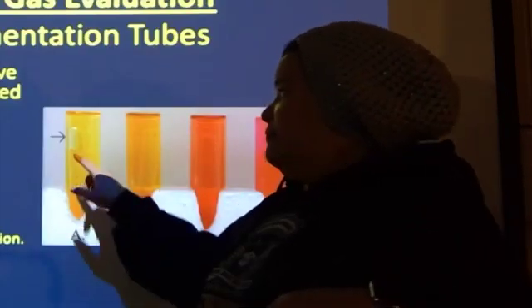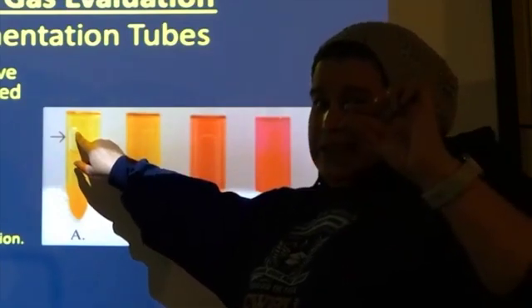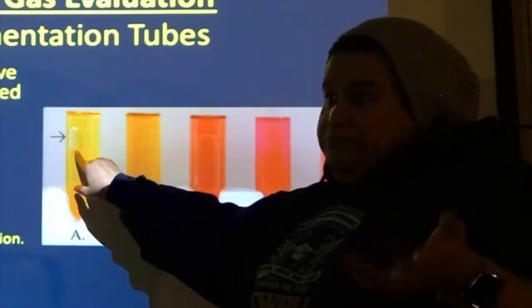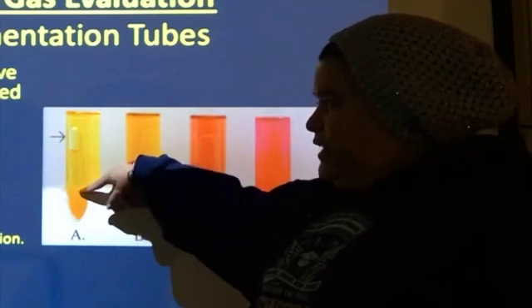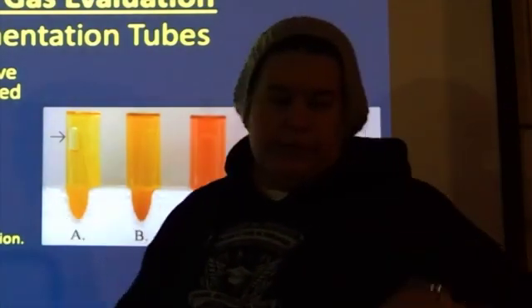Either you have a little teeny tiny bubble up here, which would be a little bit of gas. You could have this much gas, which is, you know, a good amount. Or sometimes this whole entire thing is almost full, in which case you have massive gas production.